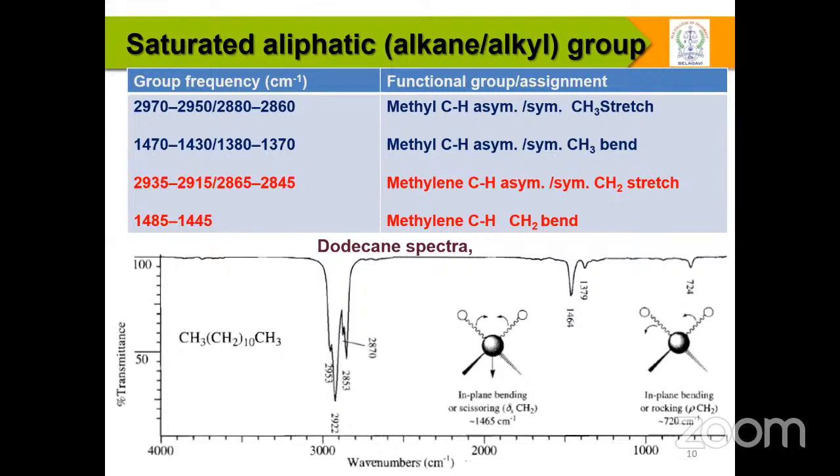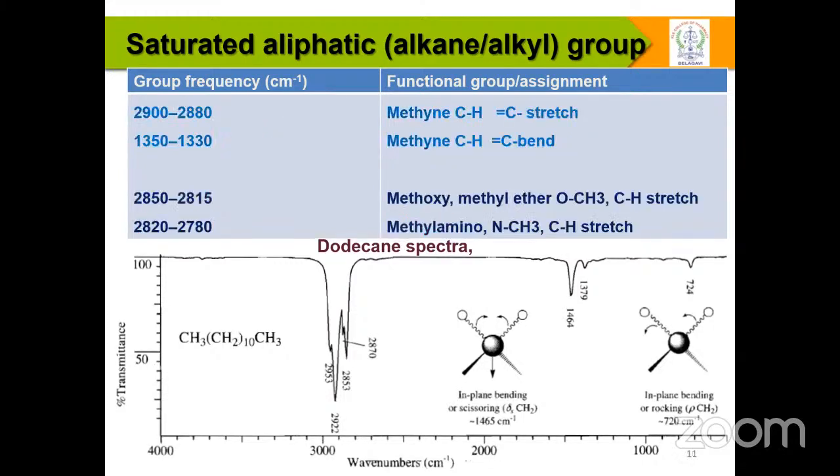But these are more or less the important ones. They come somewhere between 2992 and 2800. These peaks we are going to observe.